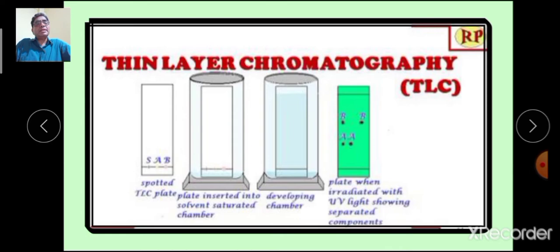The technique is the same as that of paper chromatography, but instead of paper, a thin layer of the adsorbing material is prepared on a glass plate, and that glass plate is used for separation of the components.